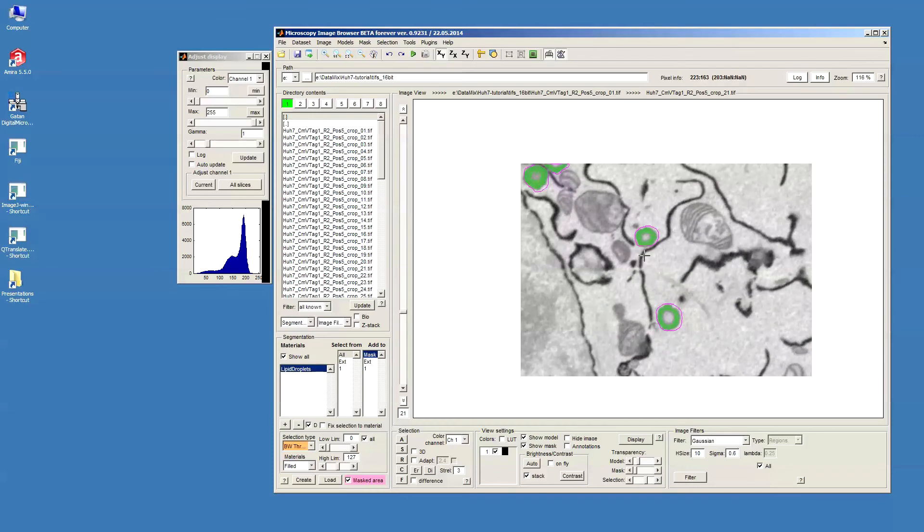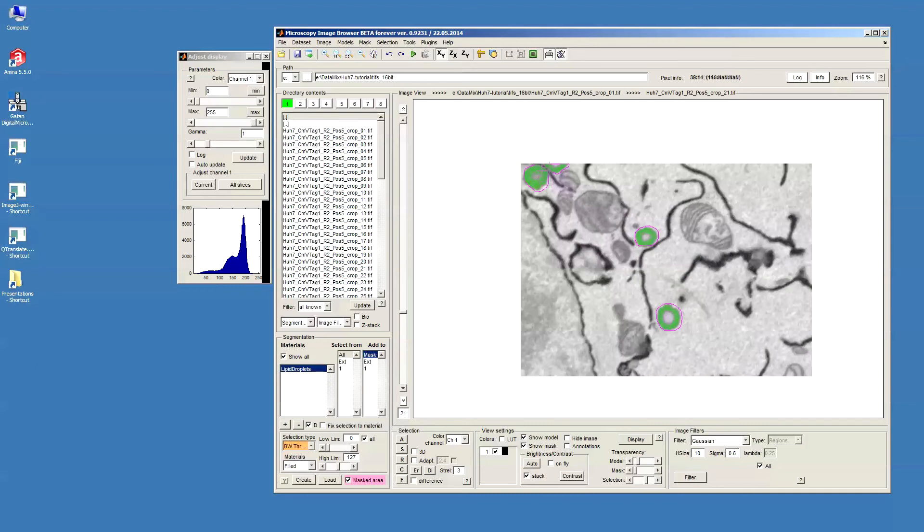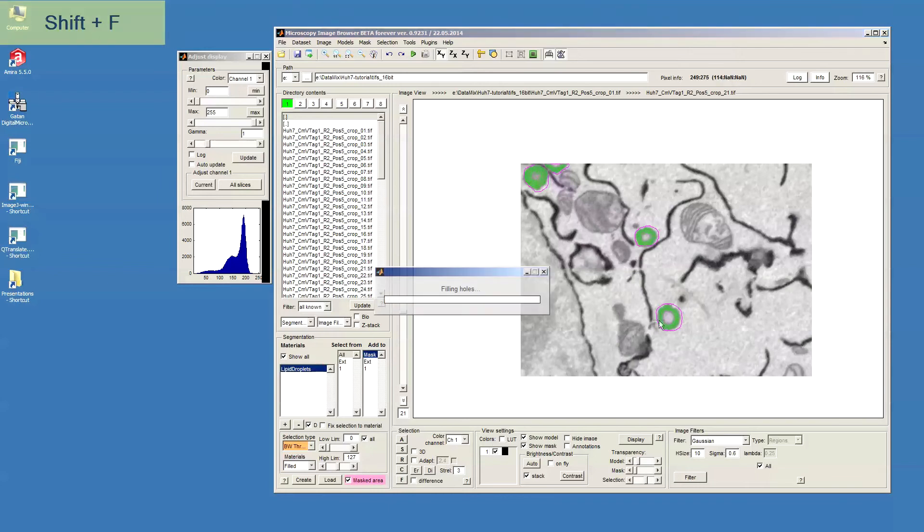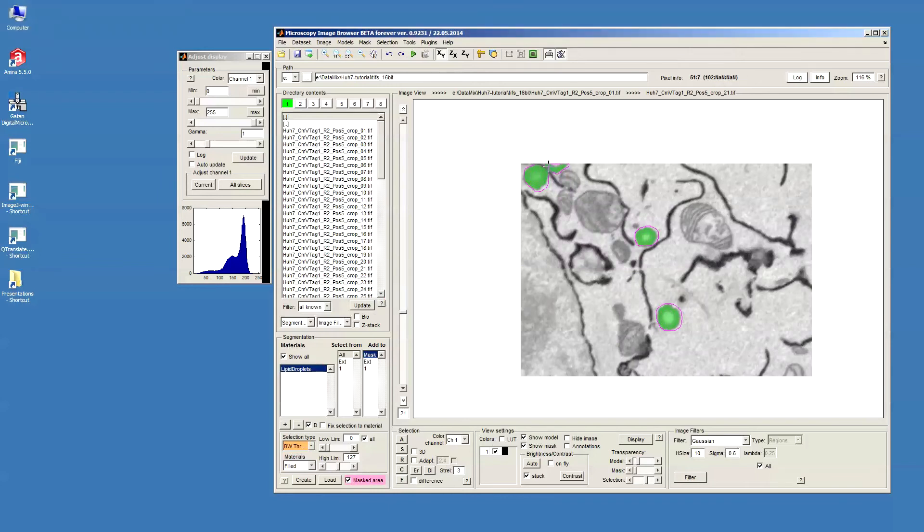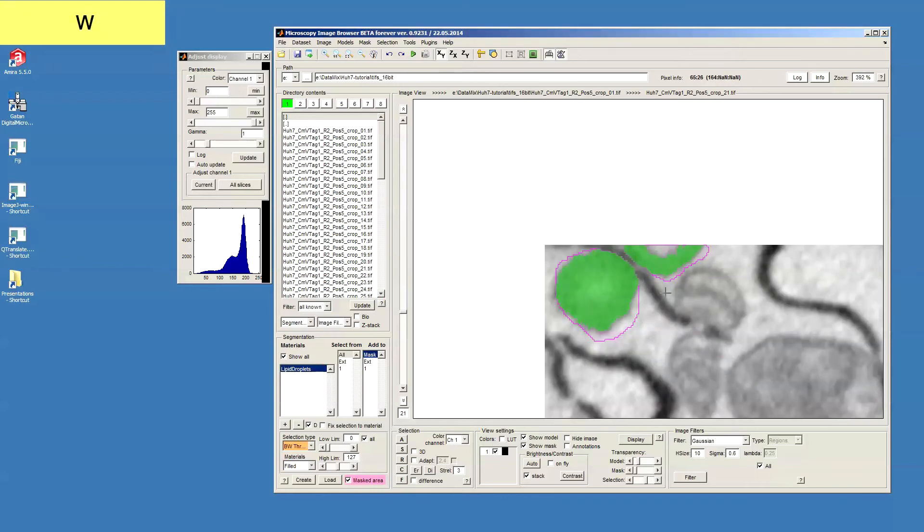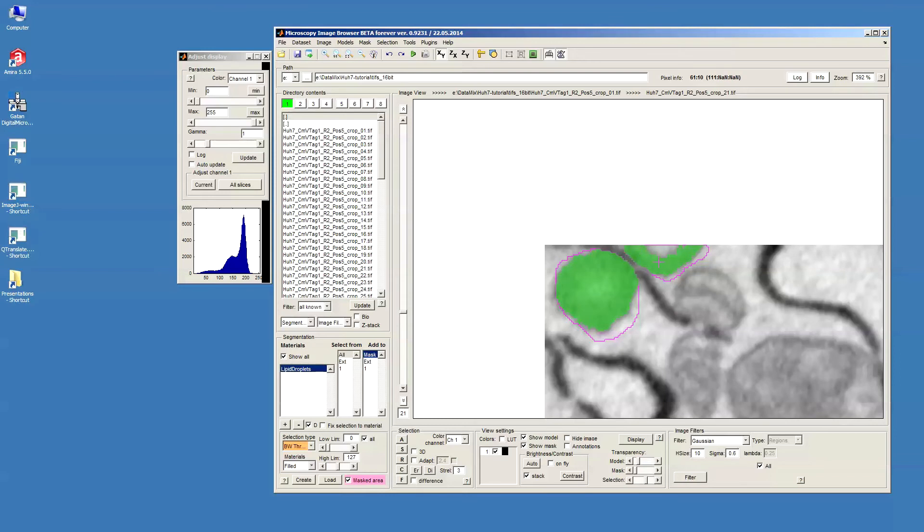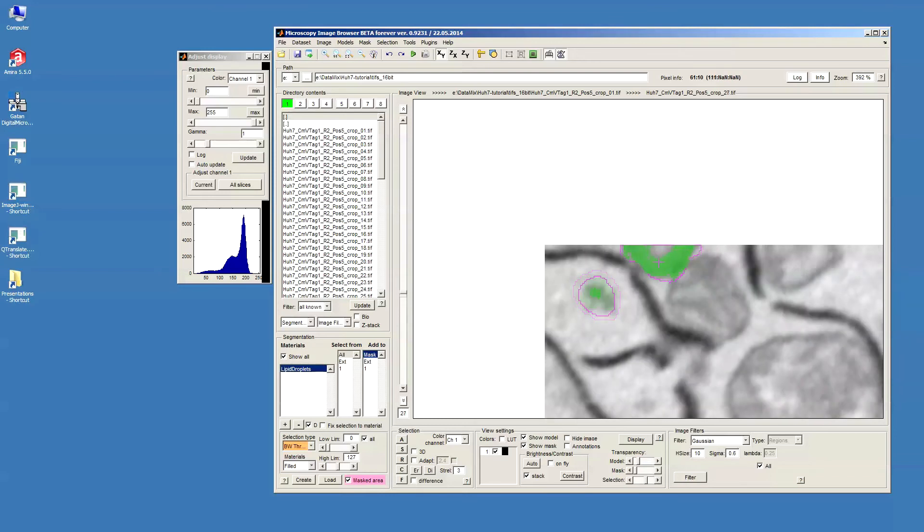Now what I can do is I am basically interested in the shapes of these lipid droplets. I don't care whether they have something inside or not. So I would like to fill these internal parts. To do that I press Shift+F. Then of course there are a few areas here that were not filled because they were not really closed. And then I have to fill those manually or keep them as it is like this.